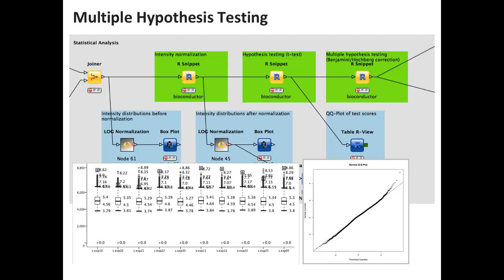And that makes it a lot easier. That is why we try to quantify first for the most part in these metabolomic studies, because in the end what you need to identify is probably not the whole world.